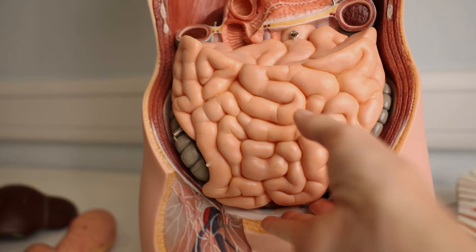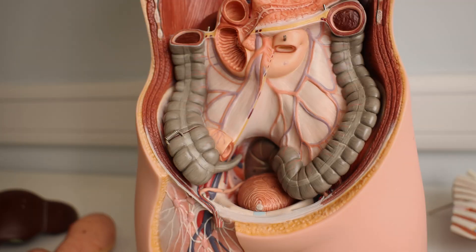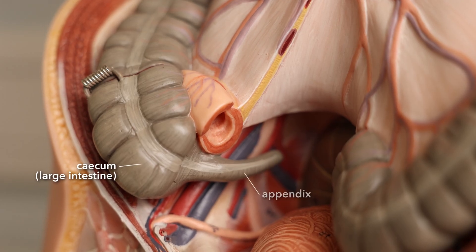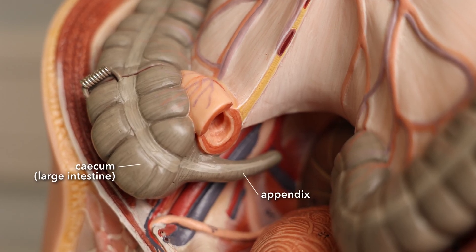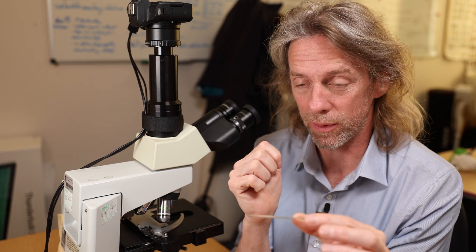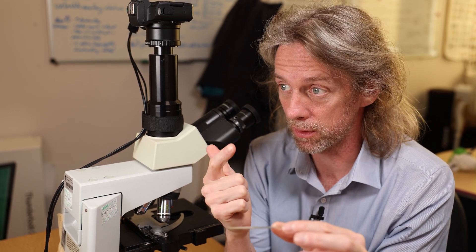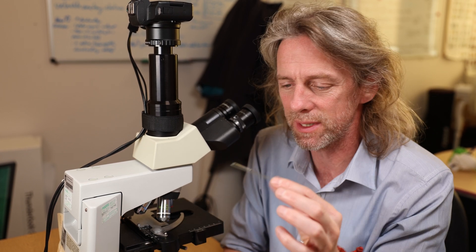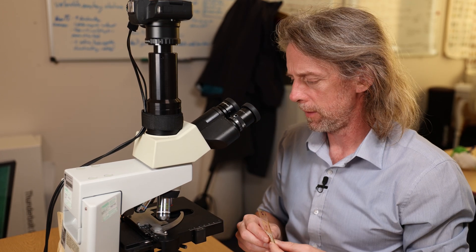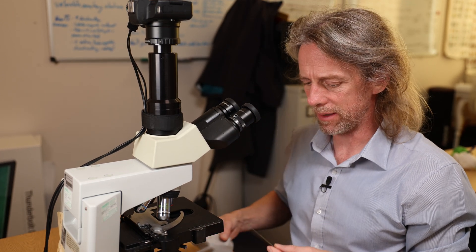The vermiform appendix — the bit that hangs off the cecum of the large bowel — what on earth does it do? Let's have a look at its microscopic anatomy, its histology. Are its layers the same as we've seen in the rest of the gastrointestinal tract — the esophagus, stomach, small intestine, and large intestine? Is it the same or different? What cells are there, how are they arranged, and what will that tell us about the functions of the appendix?